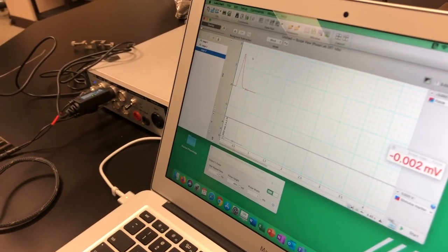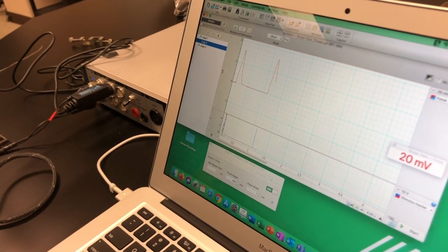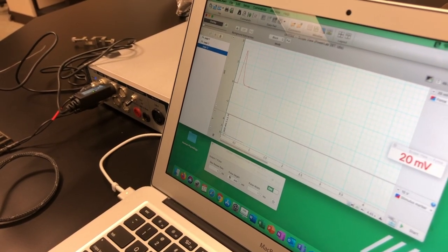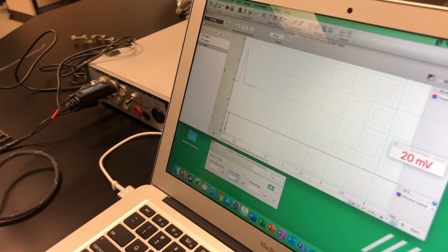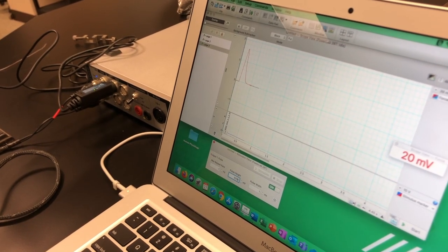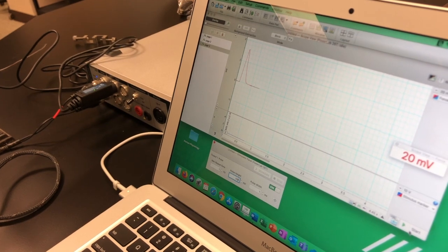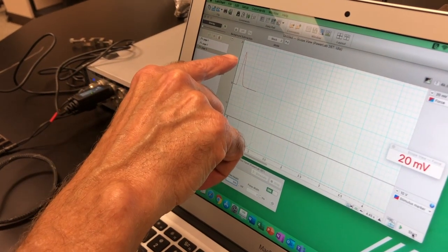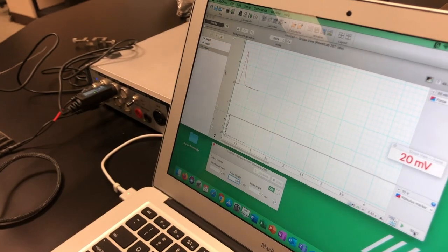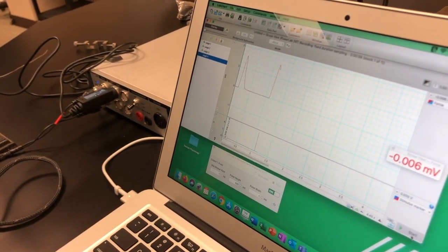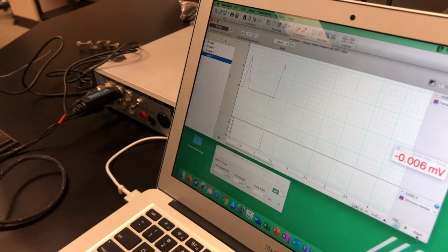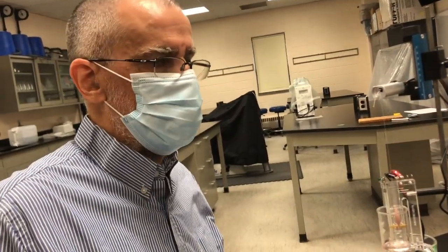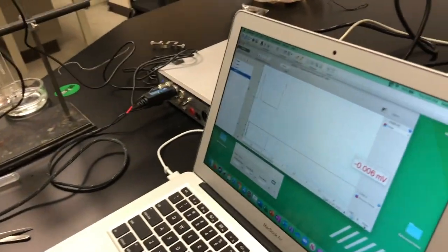We went up a step here. Pretty close to the same. Let's go up to 500 and see what happens. See if you're about the same. So here we were at 1.246, 1.6. So 1.6, about the maximum contraction we can get from a single twitch from this muscle.